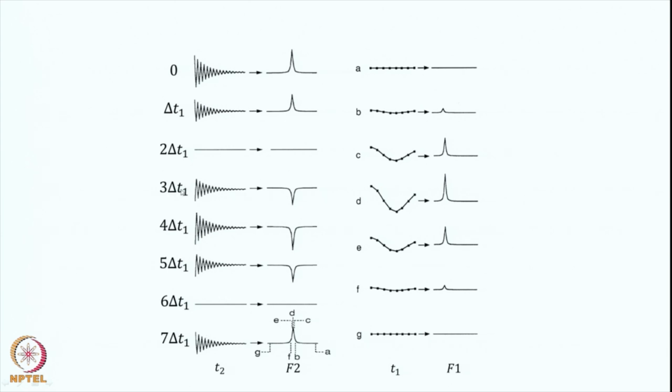So at 3 delta t1, it is now actually starting from a negative value here. If you see here, this was positive, reduced to 0 here, now it is negative, then it is further negative, and then this starts decreasing again. Therefore, the signal amplitude at the time t equal to 0 is getting modulated as you go down with the increments. So you can keep collecting such data, of course it will be repetitive, and you get a time dependent variation.